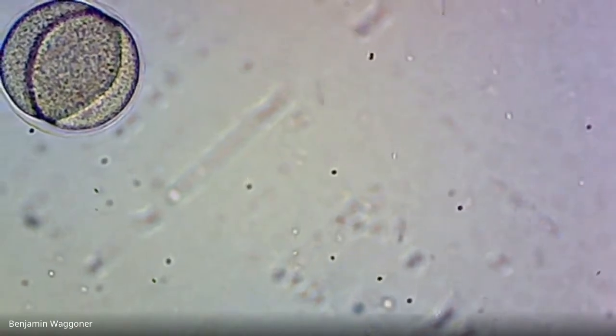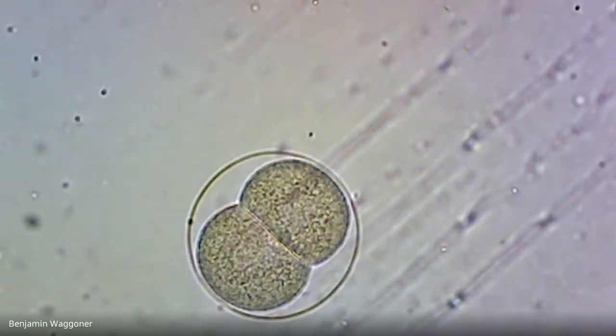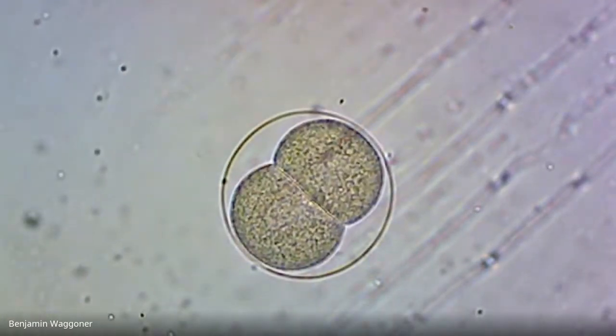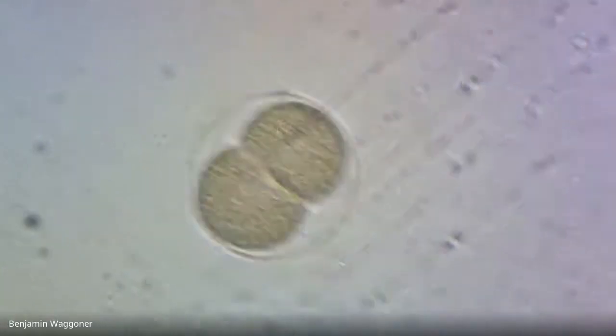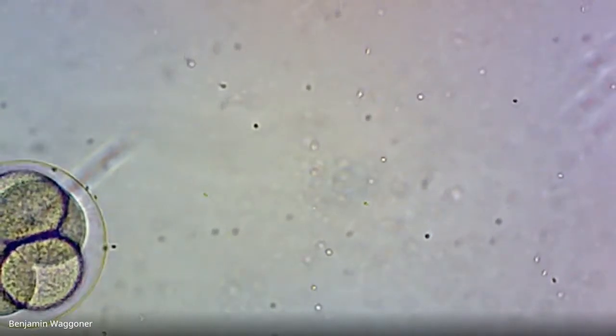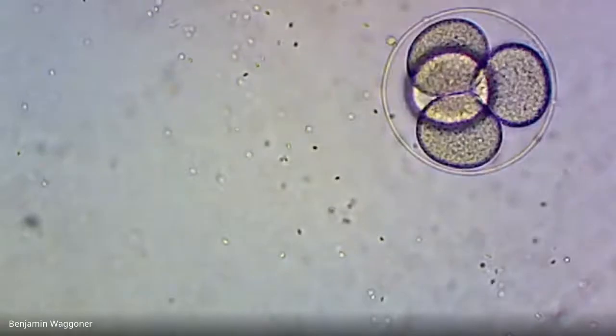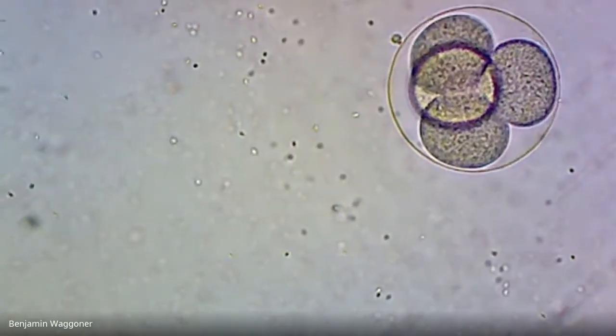Let me see. That's another view of a 2-cell embryo right there. Yeah, that's a very fine 2-cell with the cleavage furrow right facing you. So we focus up and down on that. And yes, that is a very fine 2-cell embryo. So in the time after fertilization, which has been a little more than an hour, I think by now it's about an hour 20, some of our embryos have, for whatever reason, gone a little bit farther than the others, and they've made it all the way to the 4-cell stage, and some have only divided once. But so far, they all look pretty normal.